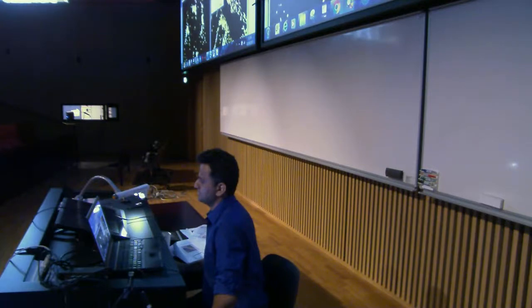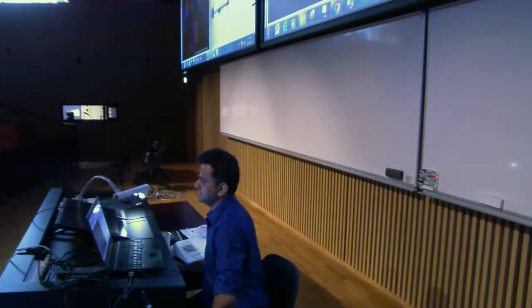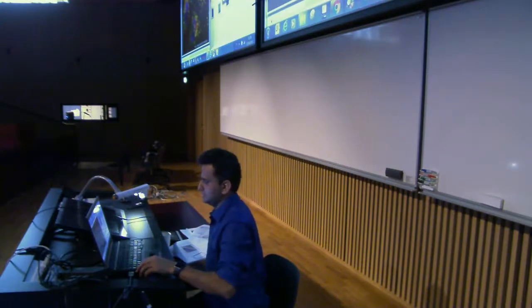So what I would do now, I would close this, open the HeLa cell again, and then highlight this, make it an RGB, and now it is displayed. I can select which one I want to display, or you can say show all.